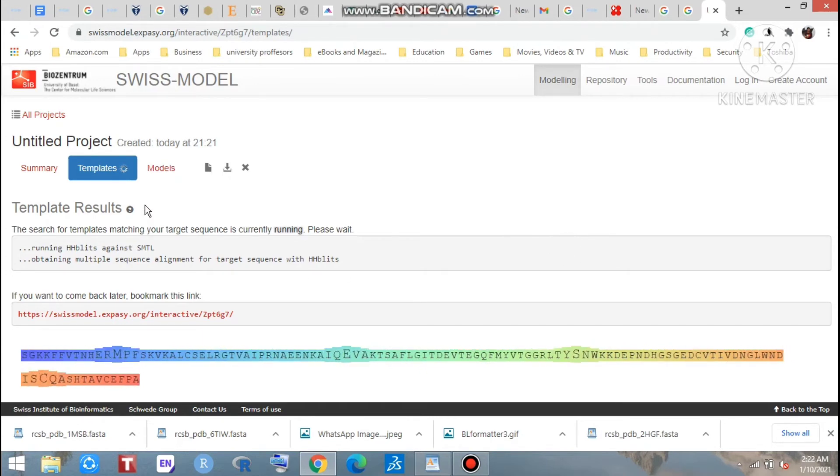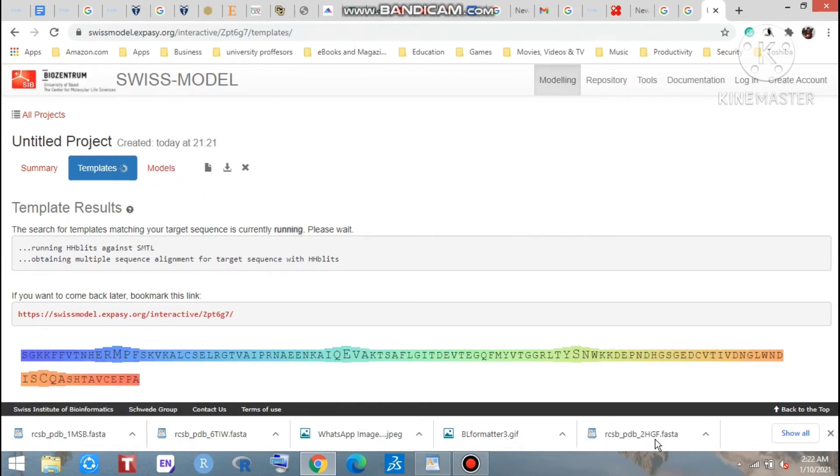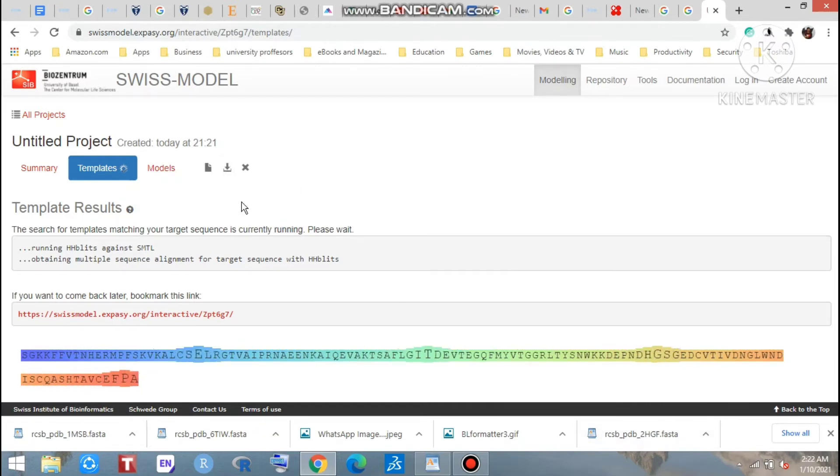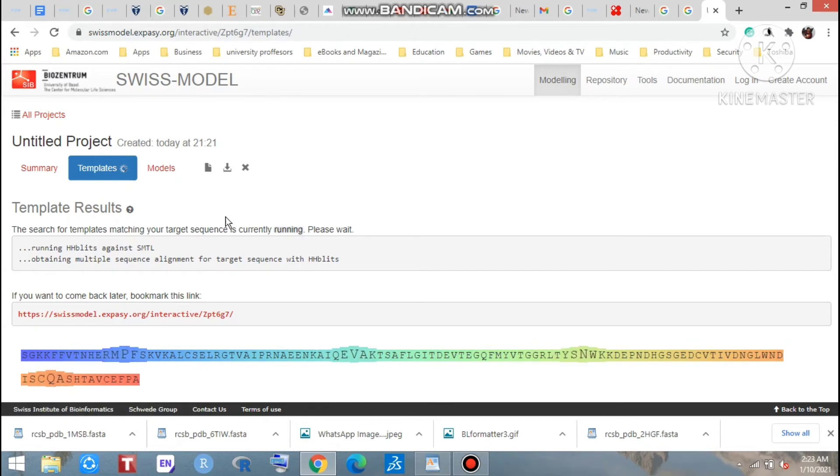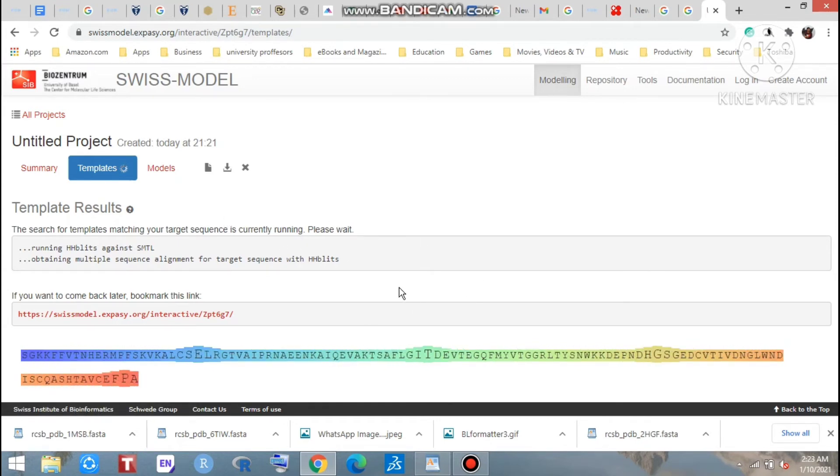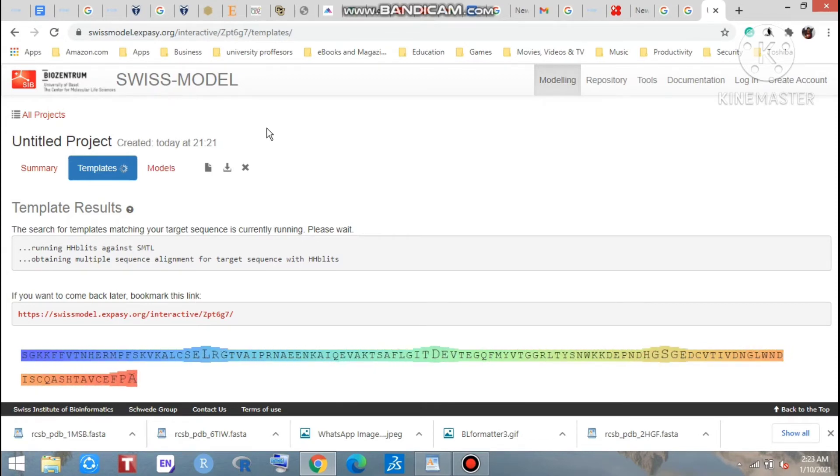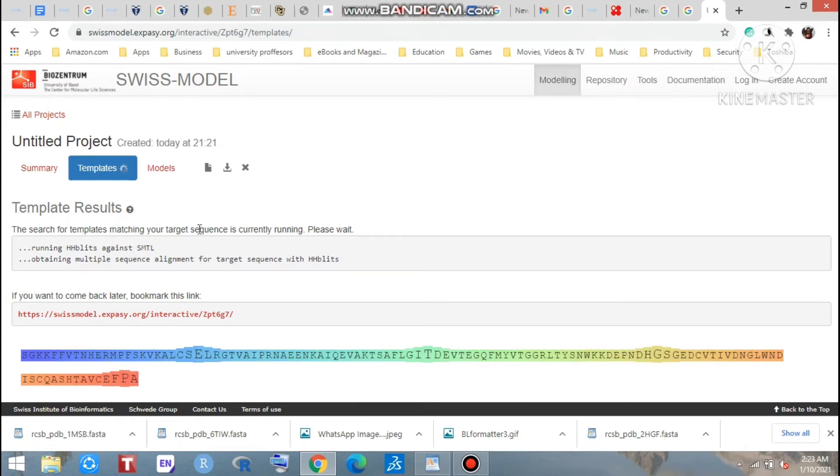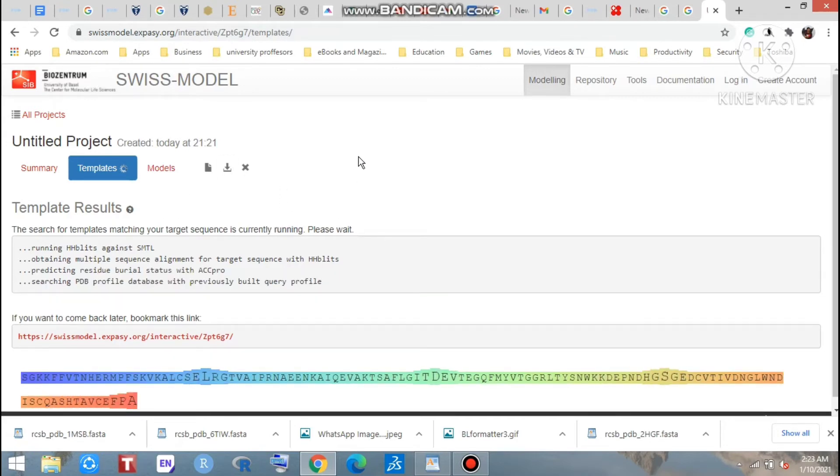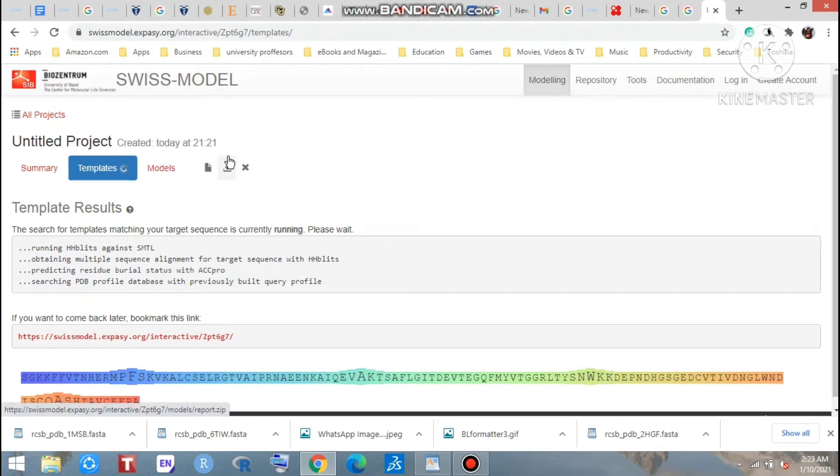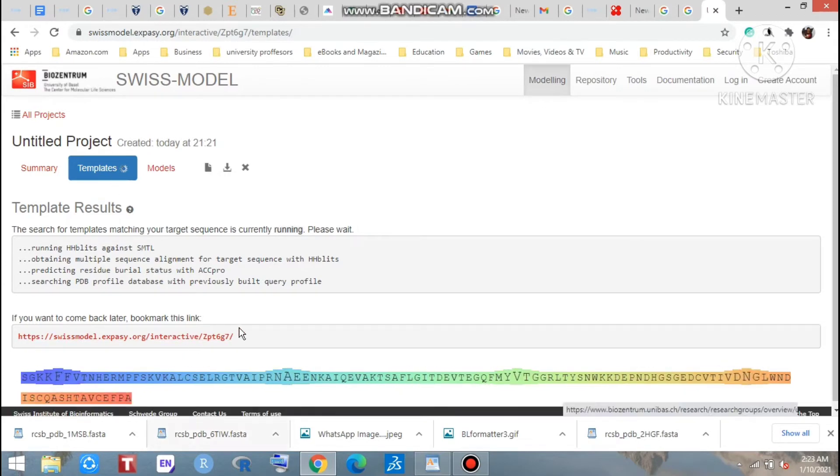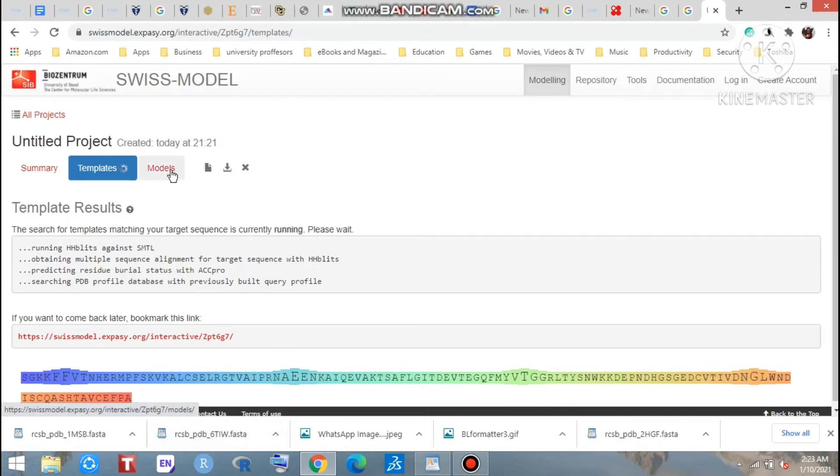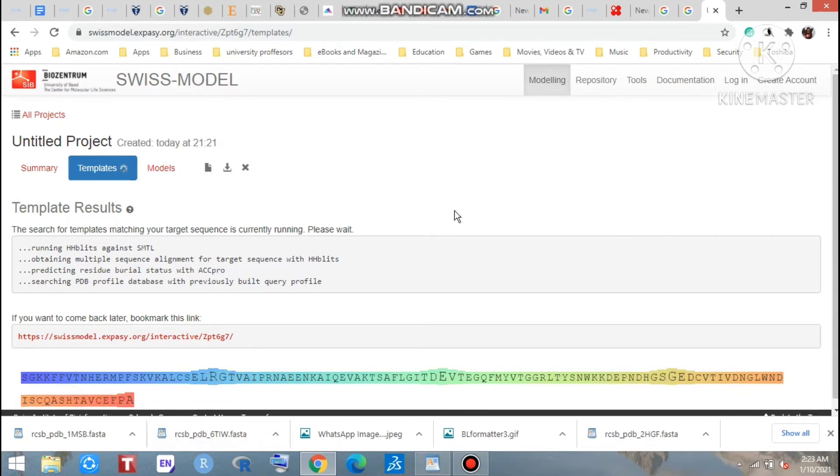Because if you go through this model building process, you will get 3D structure here, but this server is an online server, so there are some algorithms. If you don't select any template which is the best, then if you click the model, you will get a model, but that depends on the server's algorithm.